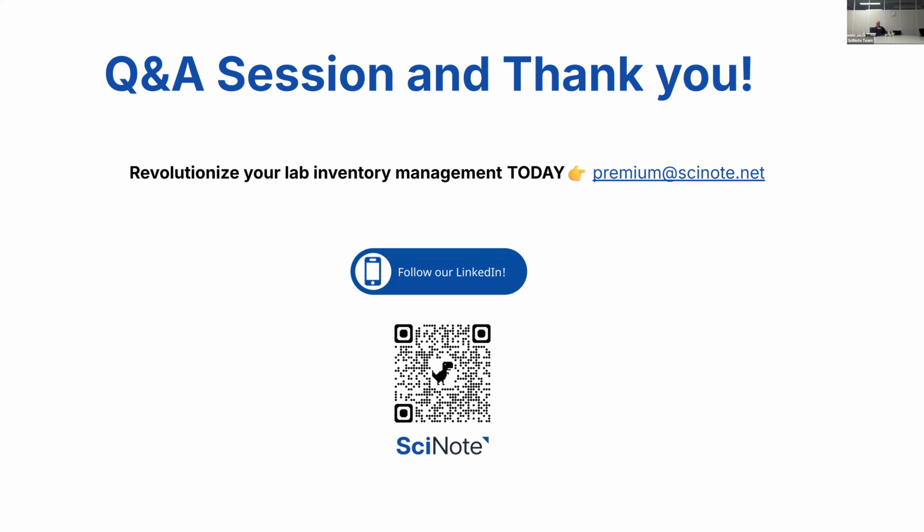Oh, there's so many questions. Let's go. Okay. Adele, number 3: are templates available for different material types? How to link to data? Yes, there are templates. We have multiple templates, not just cell lines. So you should log into your SciNote, and under inventory, you're going to find them. But also keep in mind, if you already have something in Excel today, Adele, you can import this into SciNote's inventory very easily with just a few clicks. You just need to map your columns in Excel to columns in SciNote, and you're going to have the same inventory you have there today in SciNote as well.